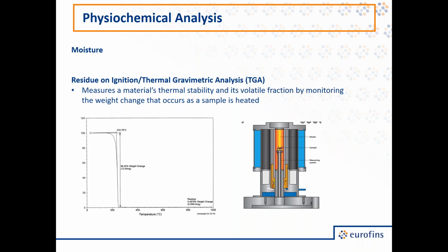The elastomers could be different, but they could just differ in the amount of carbon black or the amount of inorganic filler. And a technique like TGA allows us, even on a microscopic sample, to compare it to reference standards and help you figure out which is the source of the rubber, not just tell you that it's rubber.